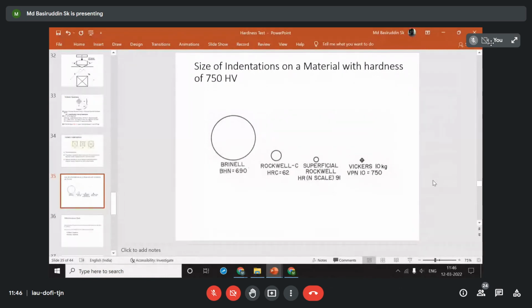Okay, so from the microstructure perspective, it is okay. You can also think of a case where you have put some coating on the material surface and you want to check it, but physically or visually you are unable to detect where the coating has happened accurately and where it has not. So in order to check that, you need to go for micro indentations or nano indentations. Then you can raster the indents. You can put the indentations on the whole material surface, creating a particular grid.